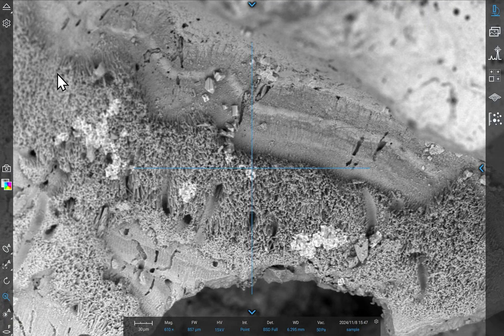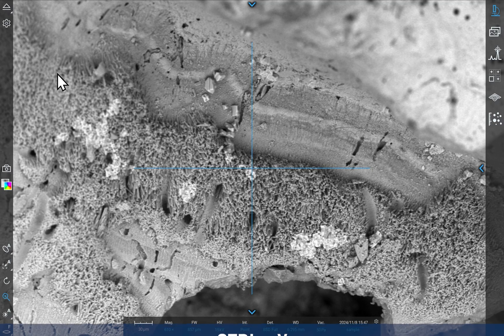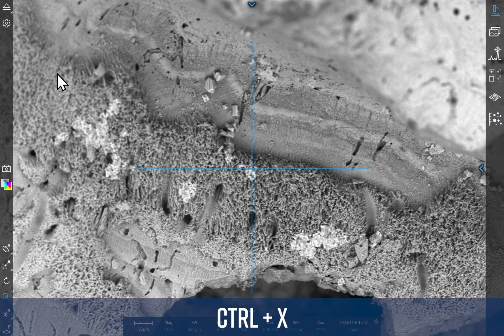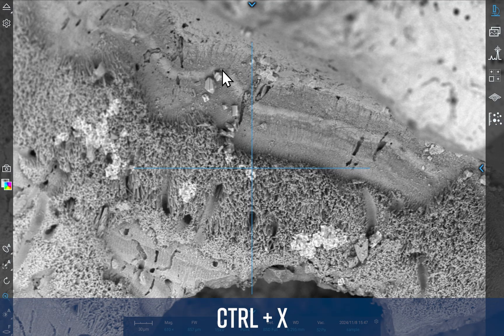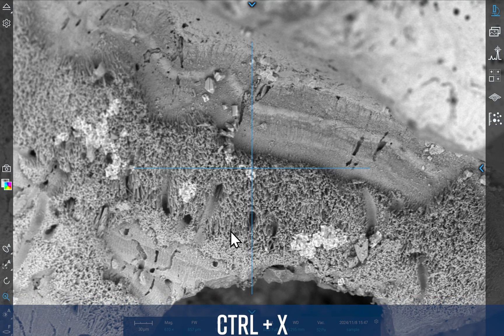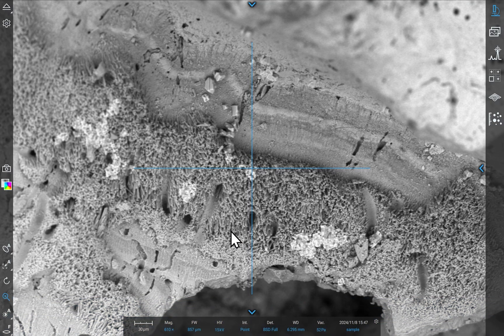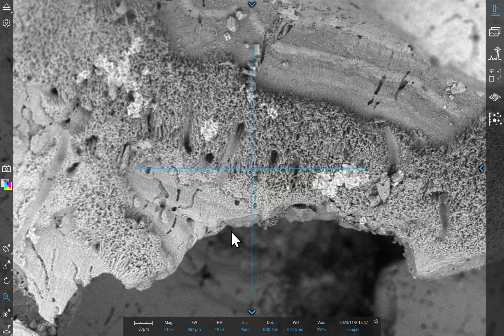You can toggle the crosshair by pressing Ctrl-X on your keyboard. To center on your area of interest, just left-click once on the field of view.